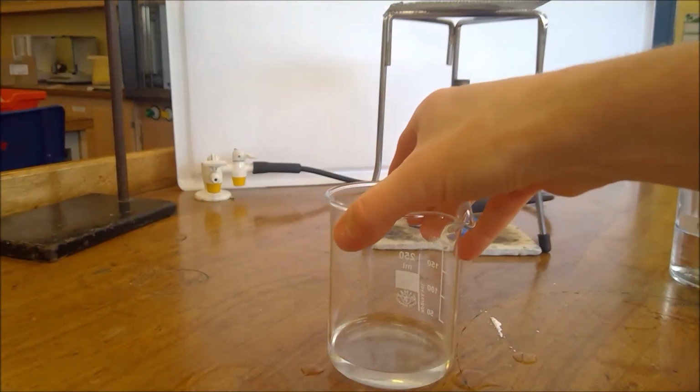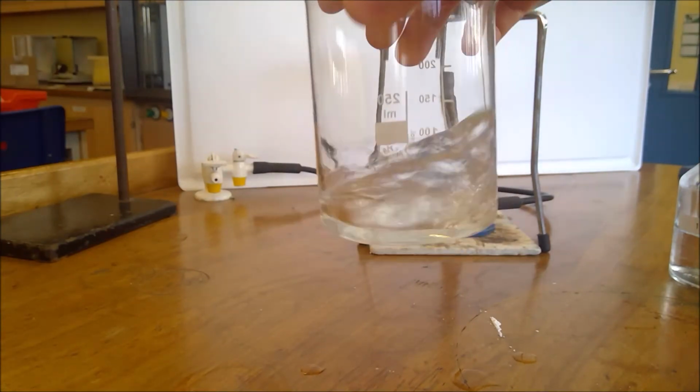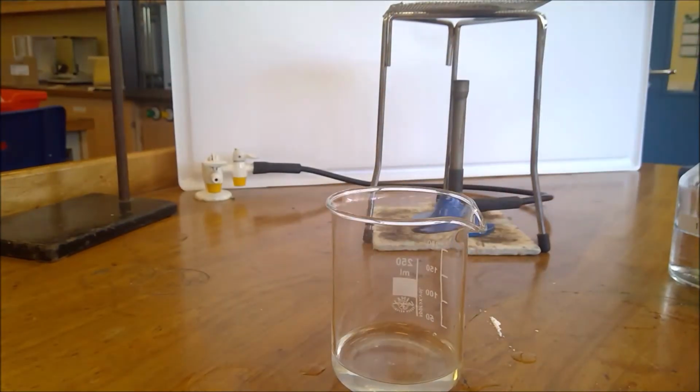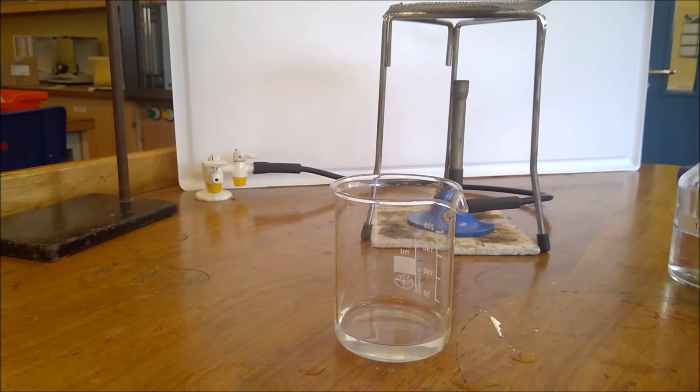So in our solution here, we have our salt and water. So we have managed to filter out our unreacted magnesium carbonate. So we've now got our soluble salt and water. So what do we need to do next in order to separate these two? So what we need to do then is evaporate off the water.